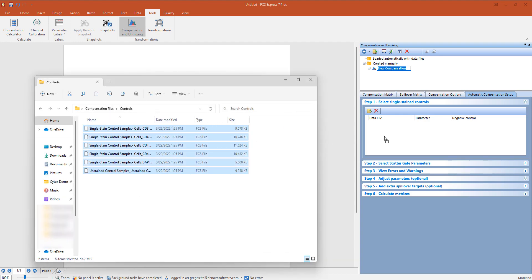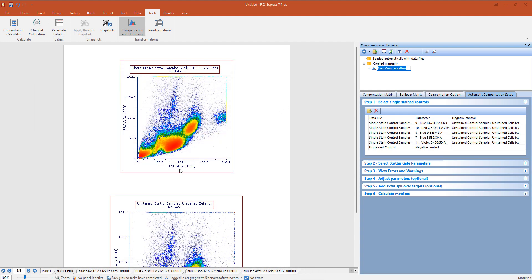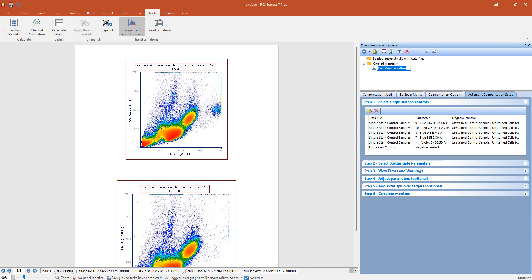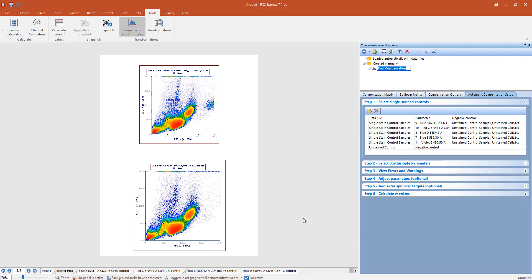Once data files have been loaded, compensation is nearly complete, as indicated by the new pages created in the FCS Express layout, which you can see towards the bottom of the screen. A difference between FlowJo and FCS Express is that we are not using separate groups or windows to perform compensation.